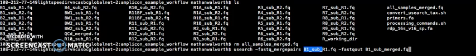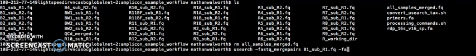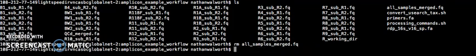So as you can see, we have multiple files we have to do this with, which is typically the case. So instead of repetitively entering this command a bunch of different times, we're going to use a little bash shortcut that with one line of command we can work on all the files at once.